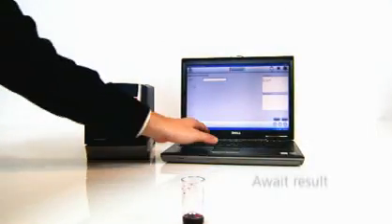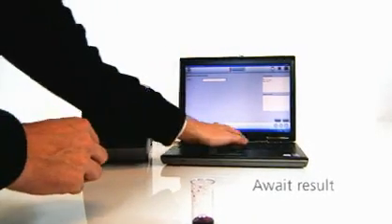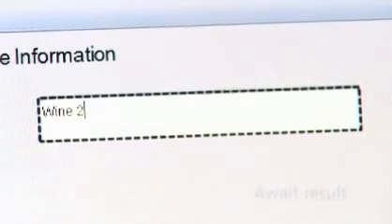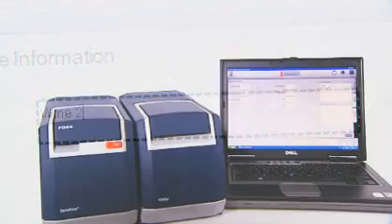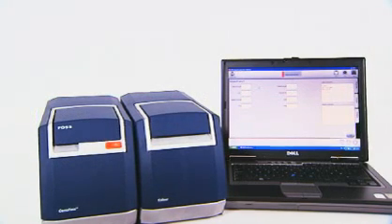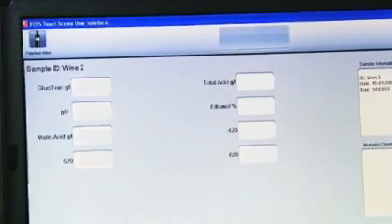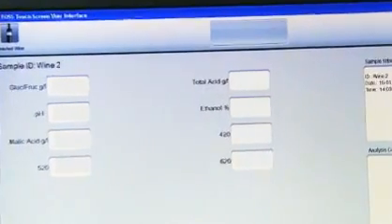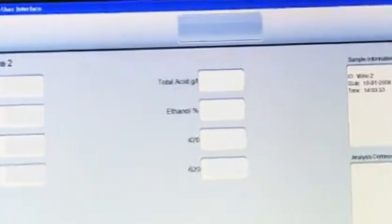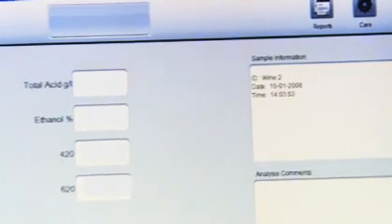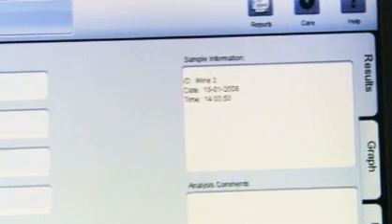Wait a few minutes to get the results. This is an ideal time to register your sample via the computer software. Note that the sample registration form can be customized to your requirements when the instrument is installed.